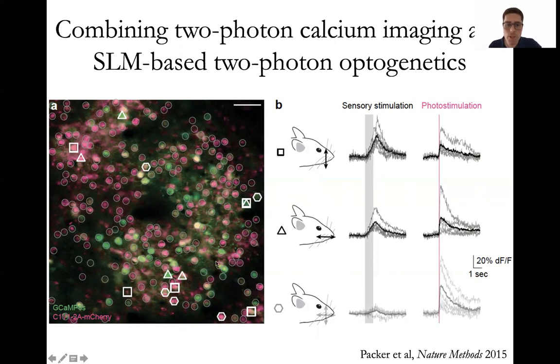And we can find neurons, shown by the triangles, which are active when we flick the whiskers in another direction. So this neural activity recording is in units of fluorescence versus time, but it's basically an indirect readout of the neural activity in these neurons in response to the sensory stimulation. There are also neurons out there that don't respond to either of these particular stimulations. Presumably they respond to some other sensory stimulation.